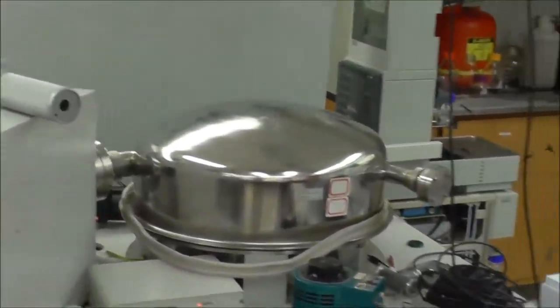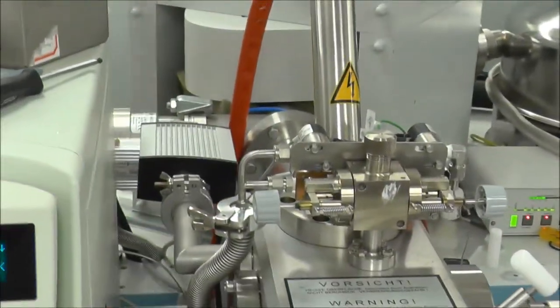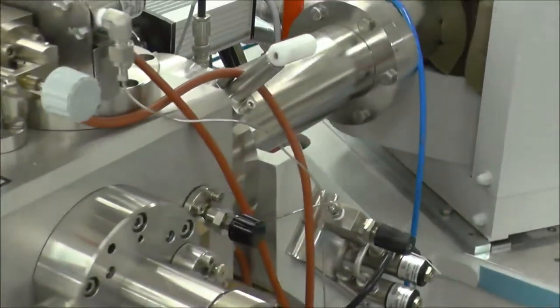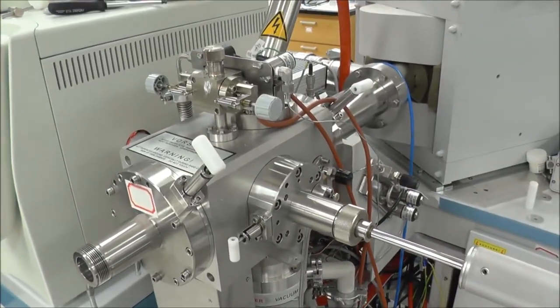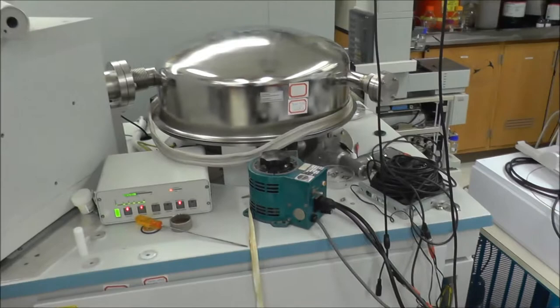So if you see this big magnet here, the ions come in, the magnet makes them turn, the radius is determined by their mass and how the magnet's tuned up to, and we detect them there. So we can scan the magnet and count all the ions.